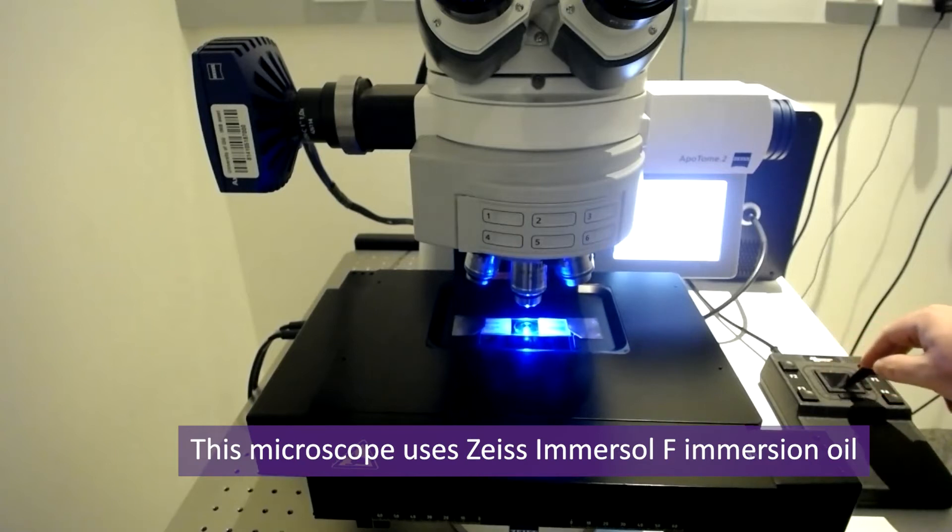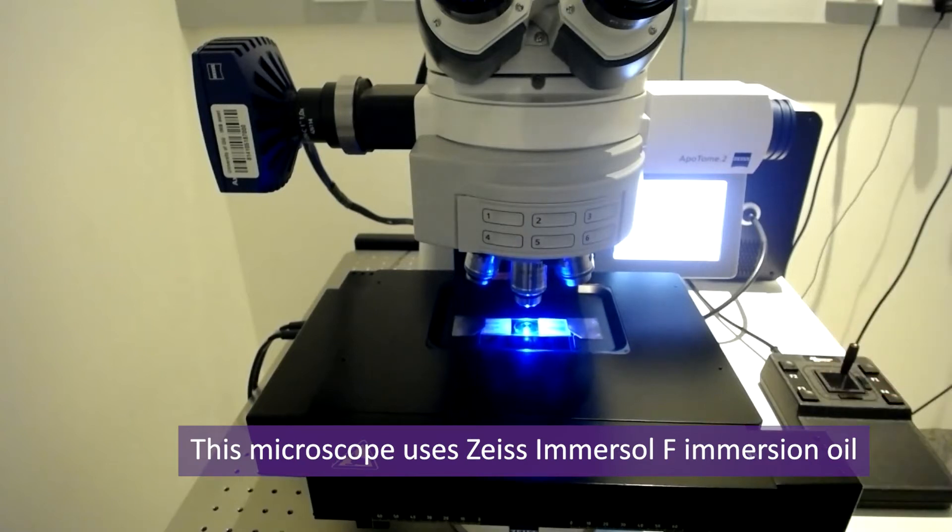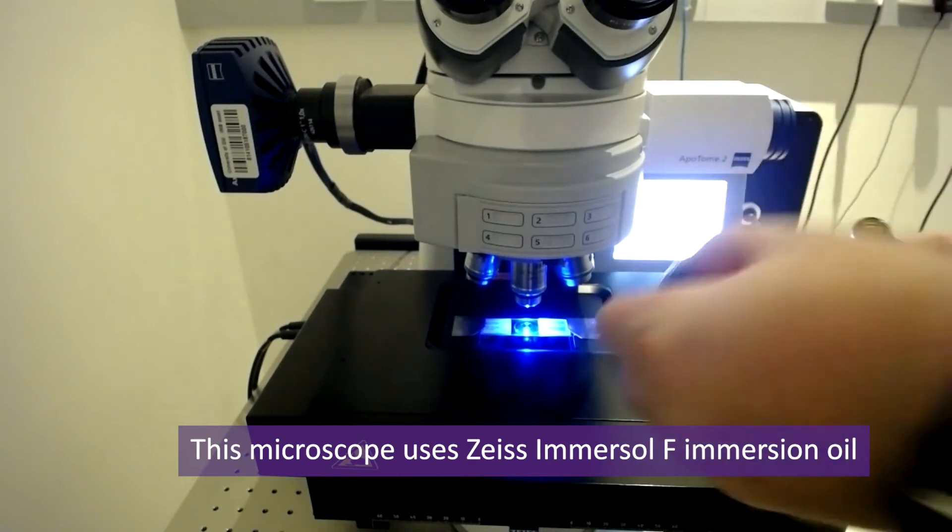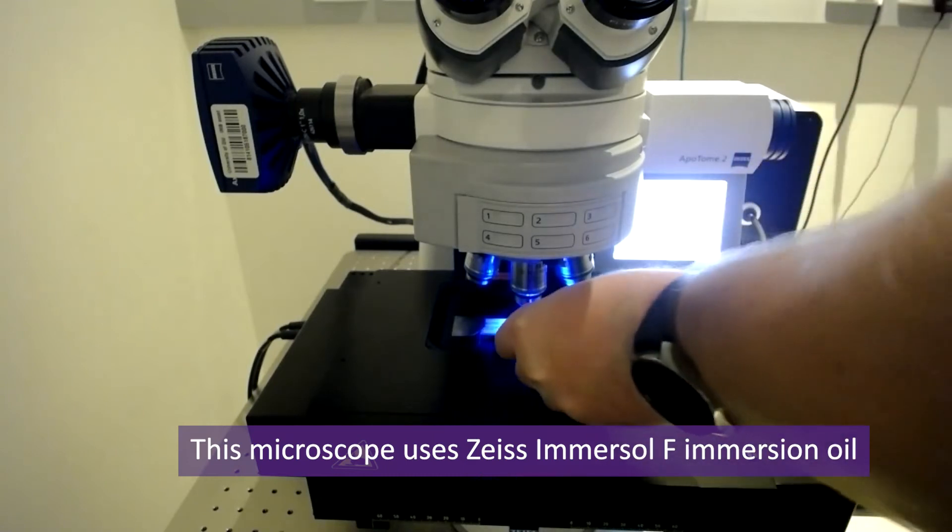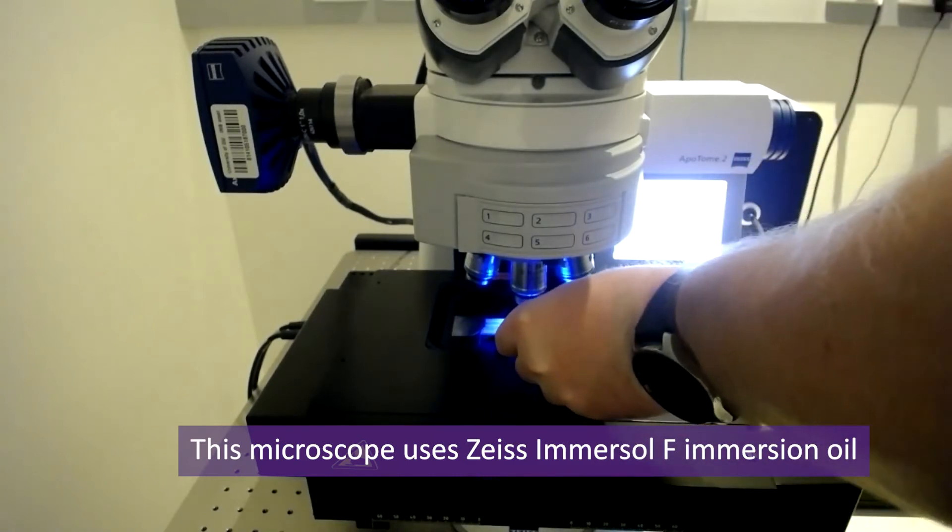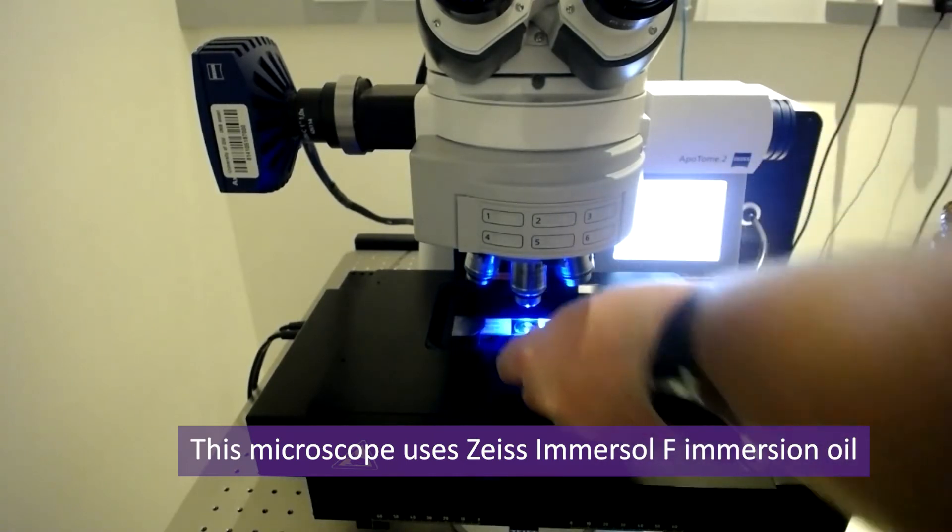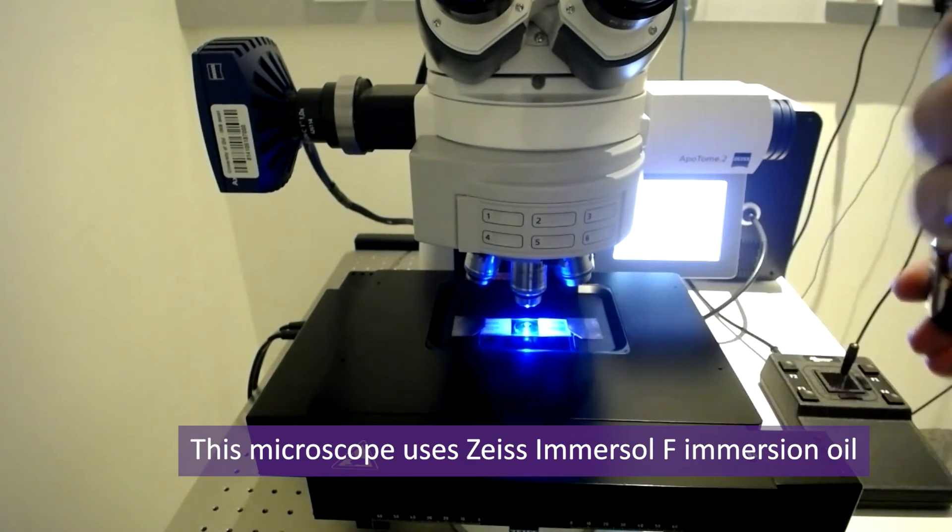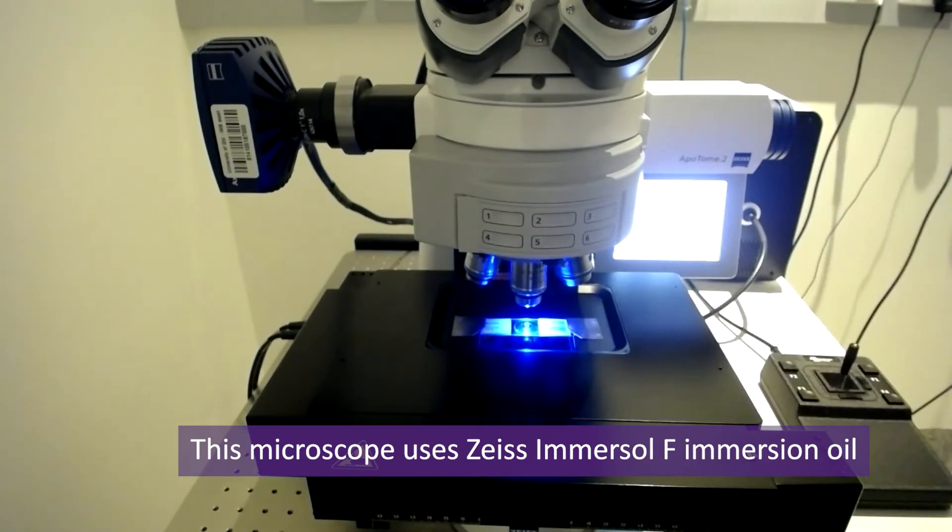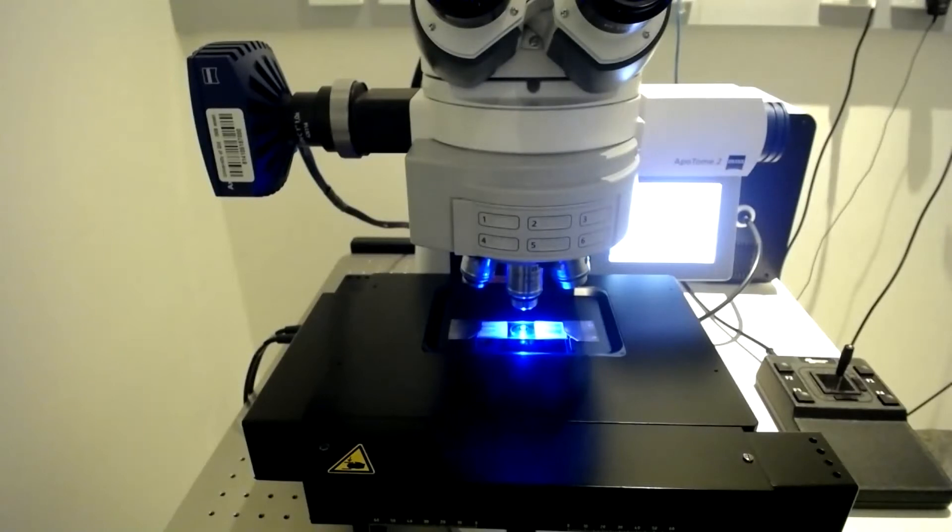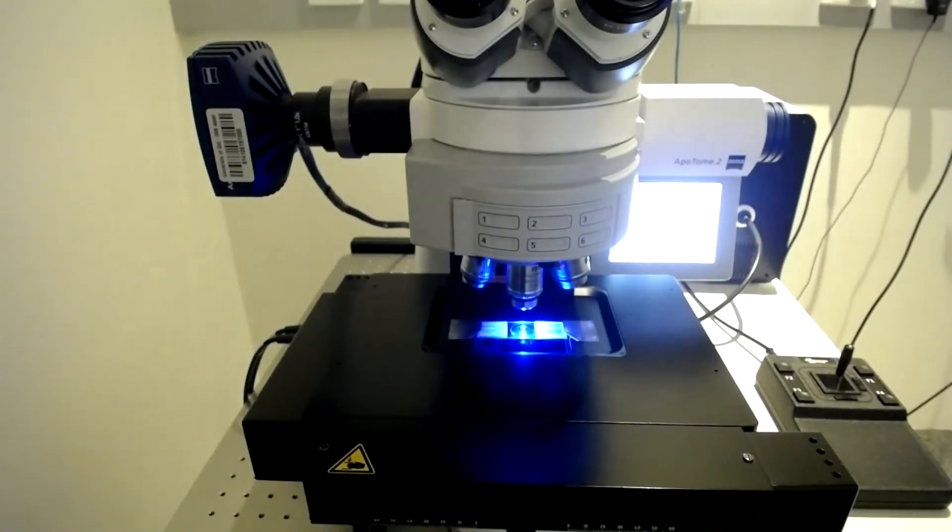I'll need to add immersion fluid onto the slide first. For this, I'll use the Zeiss Immersol F oil. Move the stage to the approximate right position under the objective and place a small drop of oil onto the slide.